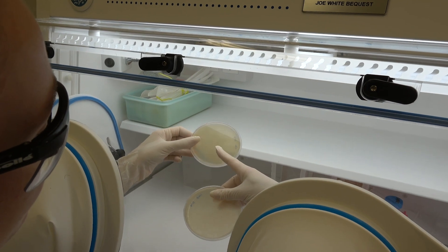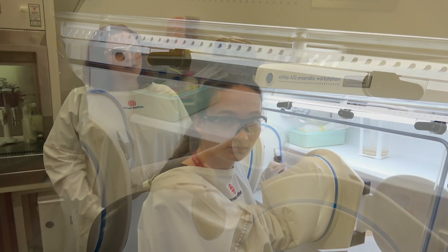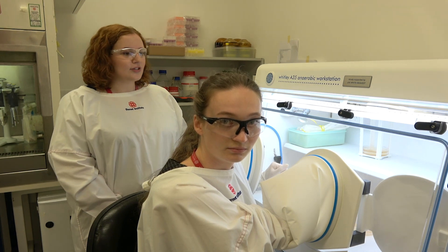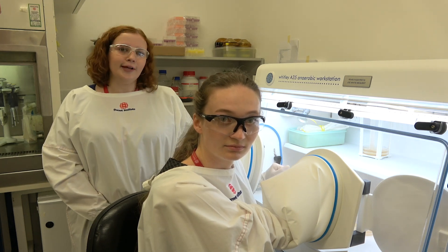In the vagina where these bacteria naturally grow, it's a low oxygen environment. So if we just tried to grow these out on the bench, they wouldn't be able to grow. We need this chamber to remove the oxygen so that we can grow those bacteria in a special environment.